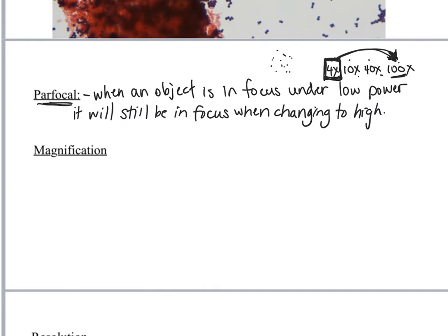The reasoning is that these first 3 lenses are not designed to view cells with the aid of immersion oil. If you get immersion oil on them, they get dirty and you can't see through them, and they're very difficult to clean. So once you put oil on, you can easily switch back and forth between the low and the high, but if you drag the 40x through the oil, again, it gets all junked up, and we want to avoid that if possible.